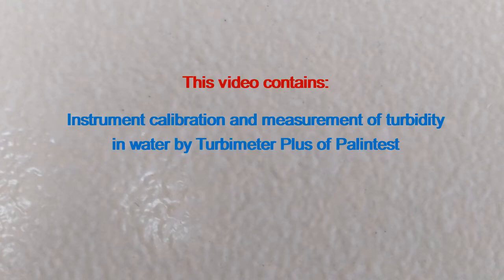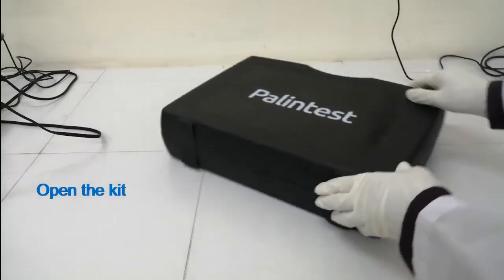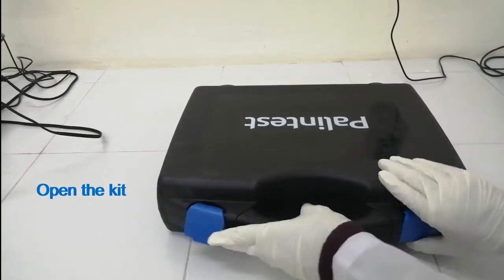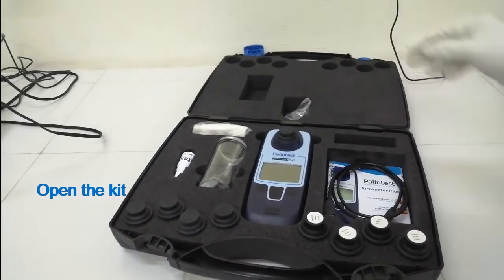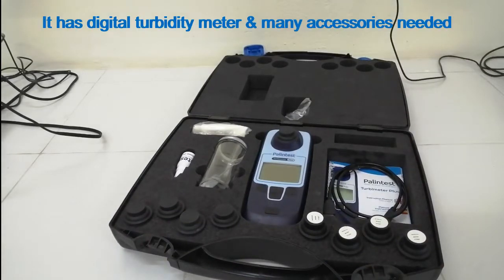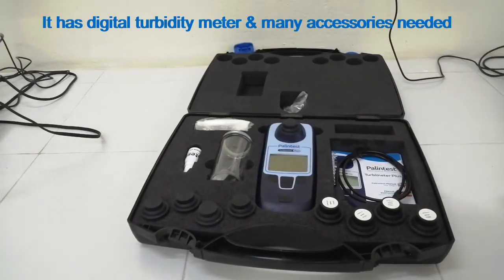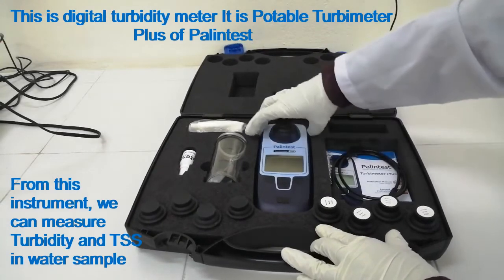This video contains instrument calibration and measurement of turbidity in water by Turbimeter Plus of PalinTest. This is the PalinTest kit of turbidity meter. It has a digital turbidity meter and many accessories needed. This is the digital turbidity meter — the Portable Turbimeter Plus of PalinTest.